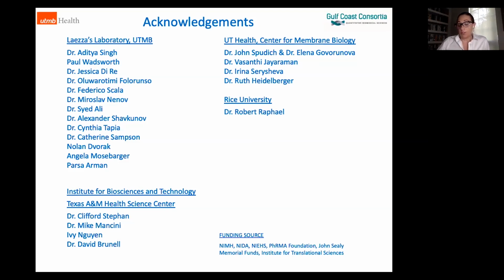And I don't want to say anything bad, just because I know people that have used the PortaPatch. I mentioned a colleague of mine, Christine Bitton at Baylor College of Medicine. She has been using the PortaPatch very successfully with many different channels, potassium, calcium, and sodium channels as well. And I know she spent quite a good amount of time optimizing the culture and worked hand in hand with Nanion. So I am confident that we will achieve our goals. But I have to be honest that this really seems to be the critical issue.